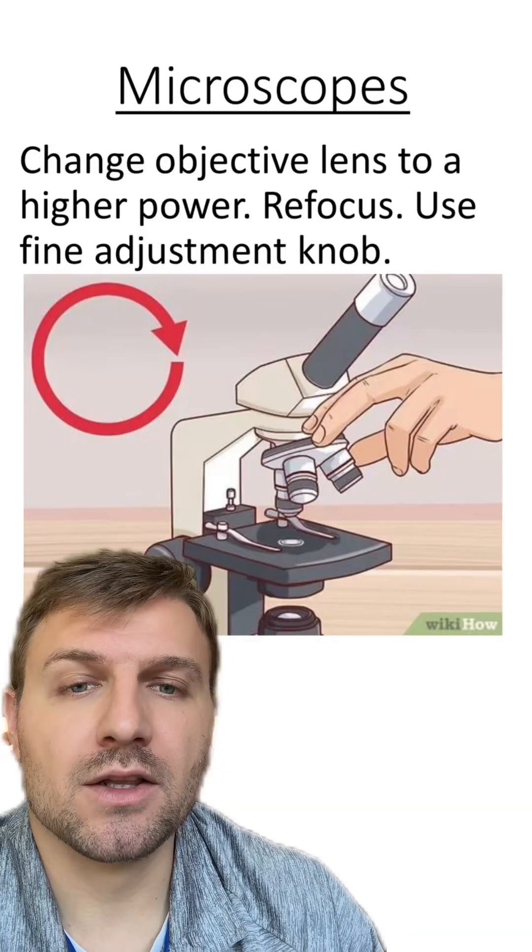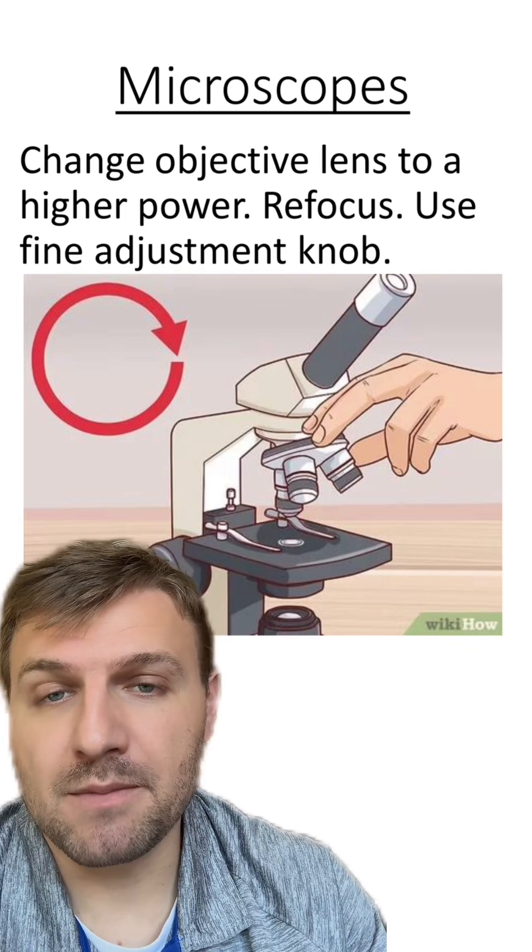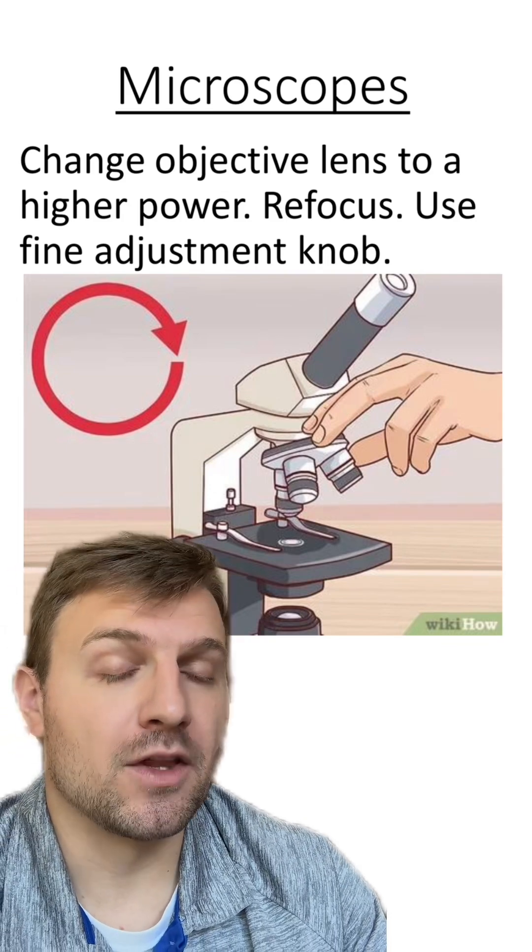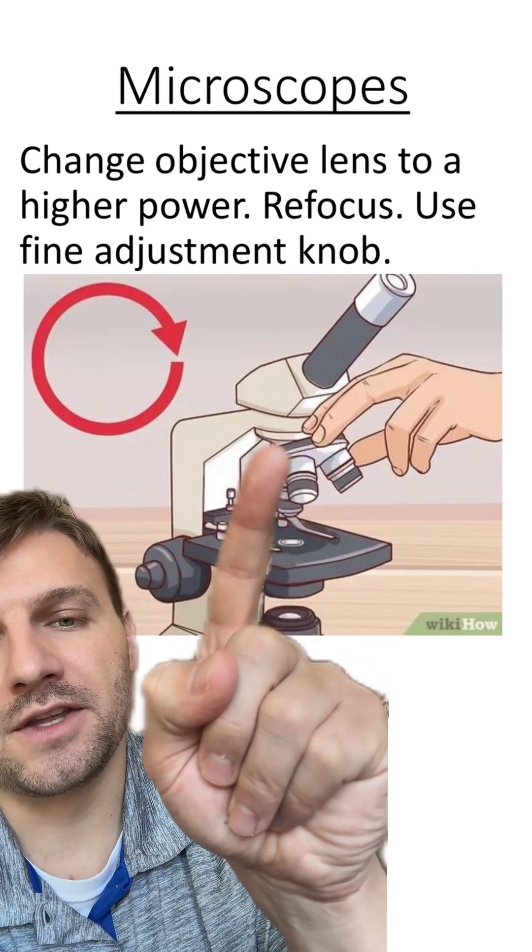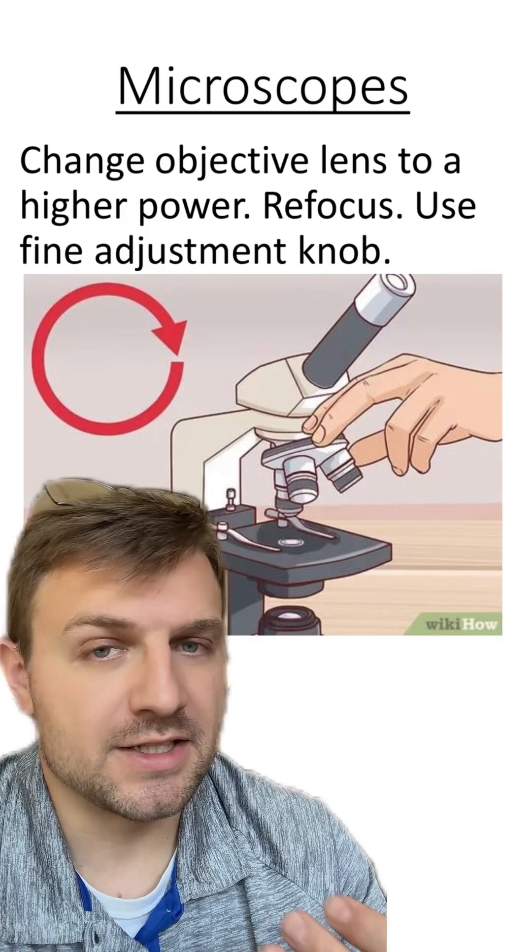After you have it focused on the lowest objective, you're going to switch to the next higher power, the medium power usually, and refocus it. It's important to remember when you're flipping to the next highest objective lens, you only use the nose piece here. It's on the top of the objective lenses. You don't actually touch the objective lenses. You don't want to damage them.